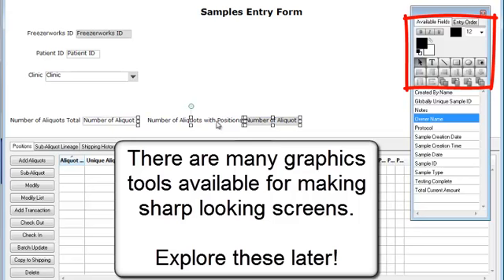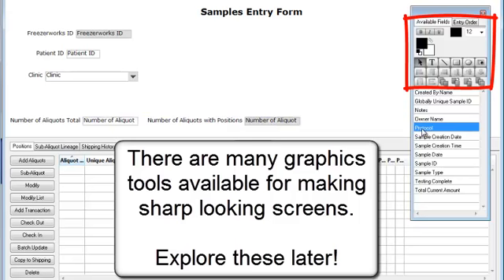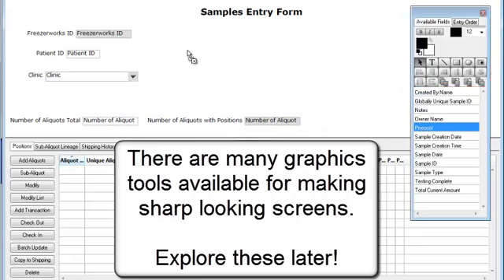There are many graphics tools available for making sharp looking screens. Explore these later.